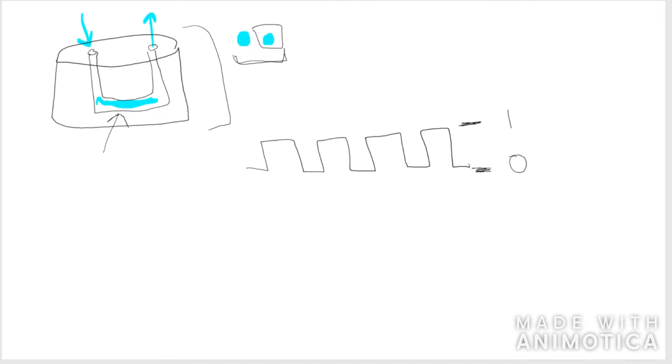When the logic gate is applied to a microfluidic channel, you sketch out a channel. Here are the inputs, and this is an output. So a logic value, let's say here's a droplet of the appropriate volume, let's just call it 1x, and a volume of 1x or greater will be given a logic value of 1.